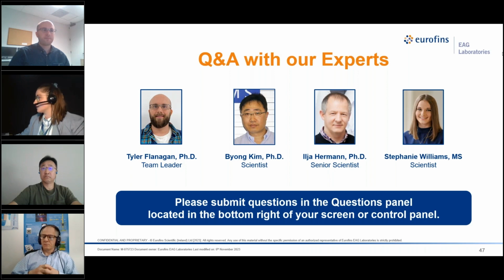Great. And we have a question for Byung. Can domain walls in ferroelectric thin films be imaged with AFM? Yes, using piezo response force microscopy, you gain three pieces of information with that technique. First of all, you get roughness and morphology information, but there is also amplitude data, just like in many of the other techniques, that will provide the domain wall contrast between different domains, and then it also comes with phase information.